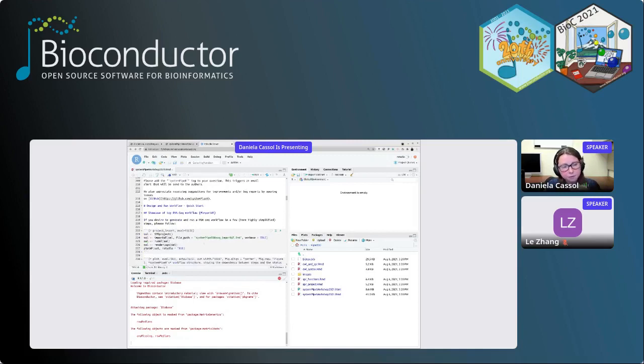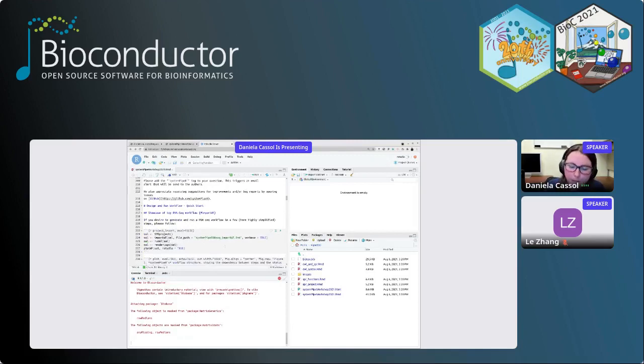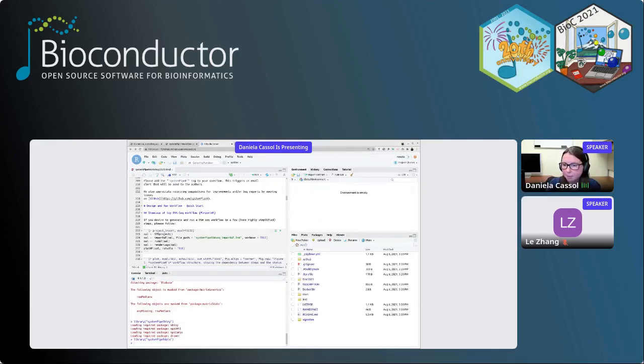And now, as I mentioned in the slide presentation, we will check for that folder structure to have the data, the results, and so on. For that, I prepared it here. If you go back to home, you can see here we have the BioC 2021 folder. So that needs to be our home directory.